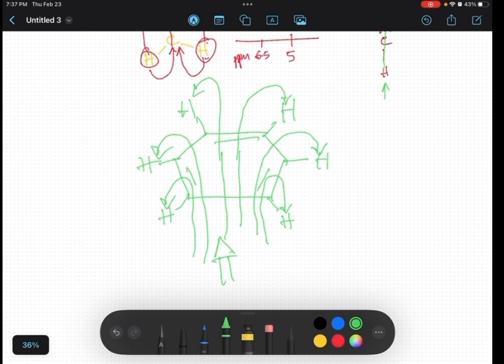That's why the aromatic protons always show up around 7 to 8.5 ppm, because when you put a magnetic field, it normally goes through the middle of the molecule, and then that magnetic field activates the outer side protons in the plane, because the aromatic ring is a planar compound.